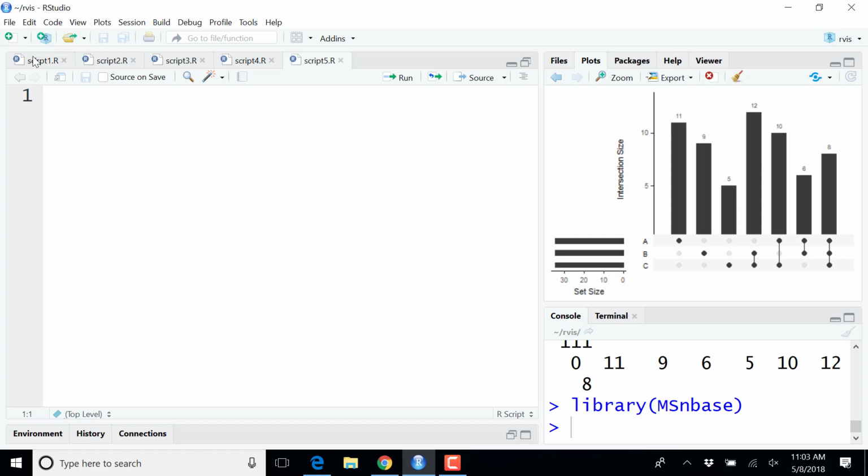Once we have these, we need to use a clustering algorithm to combine these samples based on their distances. So for example, if we look at these 5 samples, 3 and 5 are close to each other. So the first cluster that we are going to produce is a cluster that contains 3 and 5. Okay, so I'm going to write 3 and 5 here.